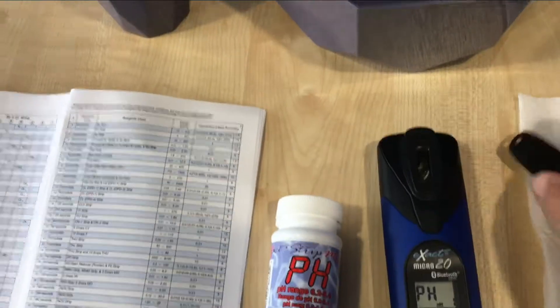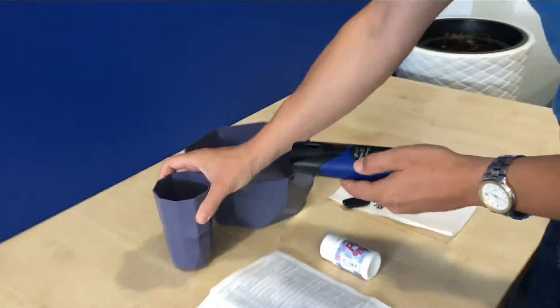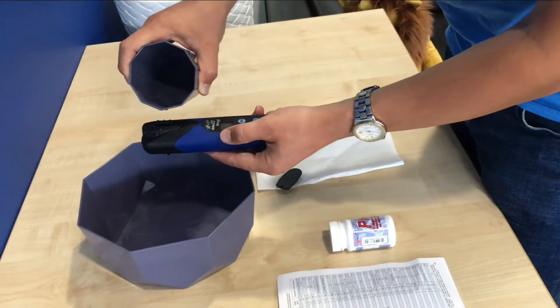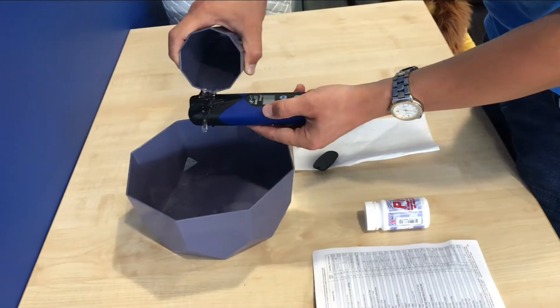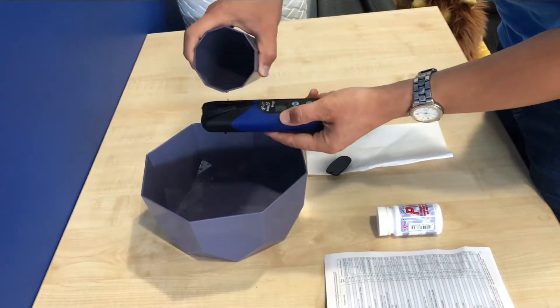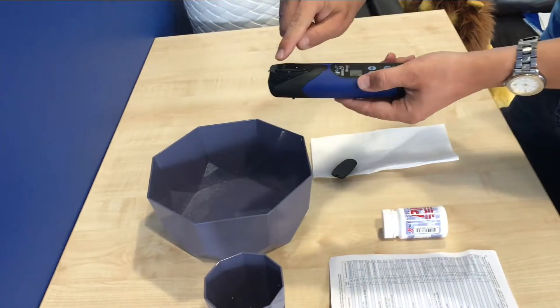Now we're going to clean the cell with the water we're going to be testing with. We rinse it three times with the test water, and then we fill it up right to the top.